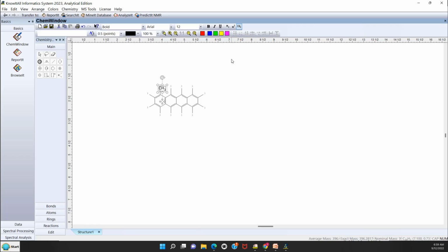If you just keep clicking on the carbon, it strips off hydrogens if you want to, so you can branch things off of it but show explicitly this carbon. Or you could just leave it as a methyl group off the aromatic ring without any carbon on it. Now if you go to the next one and you hold the Shift key while you push carbon, the C key, this time instead of carbon you get chlorine. So we're just getting the common ones they have hotkeys for.